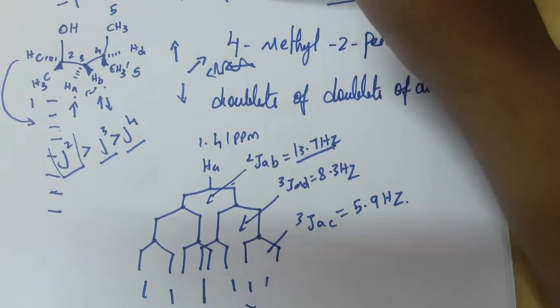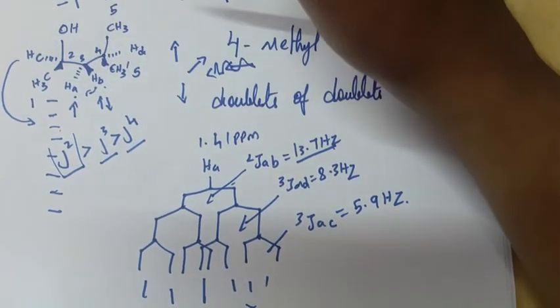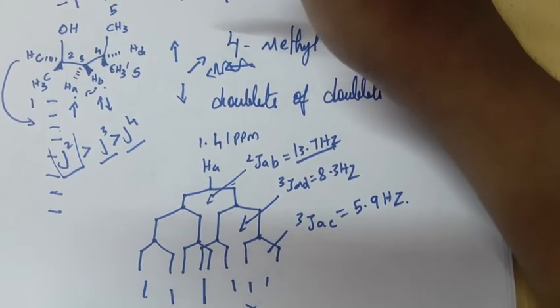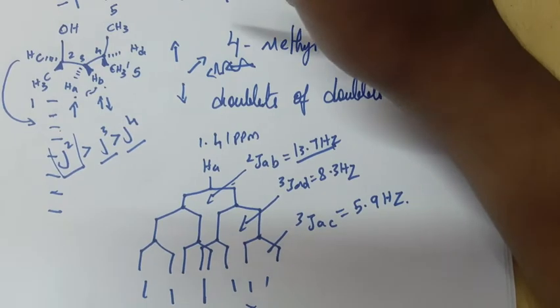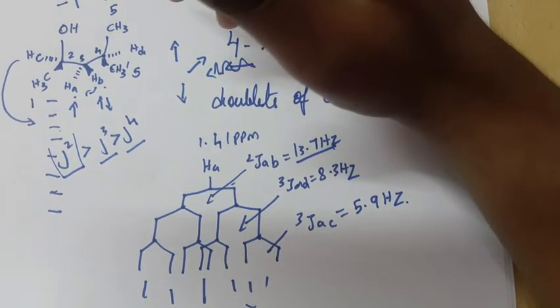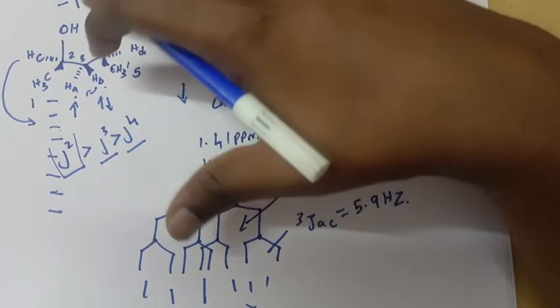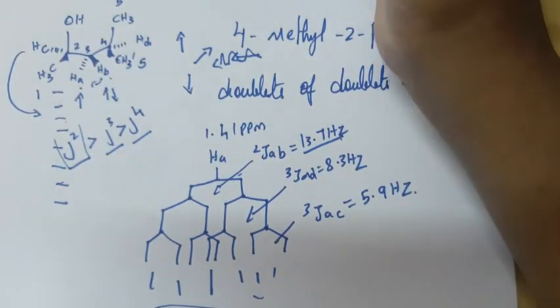We get more information about an unknown molecule in NMR better, but in terms of realistic picture, how many of them own an NMR? It's a very costly machine. You need liquid helium and superconducting magnets. In that case, mass spectrometry has the upper hand.